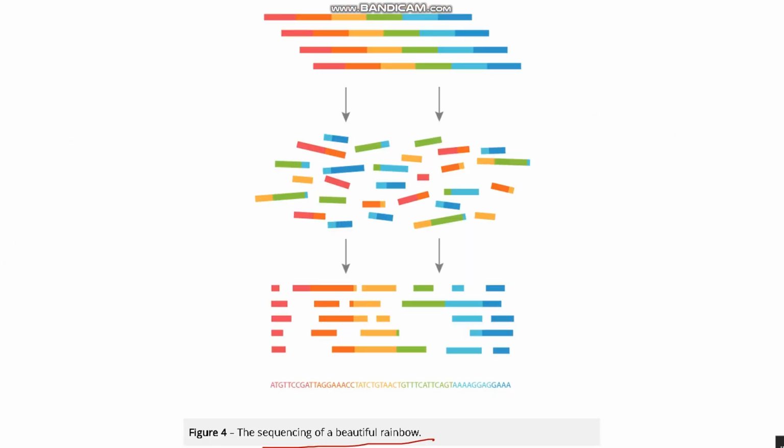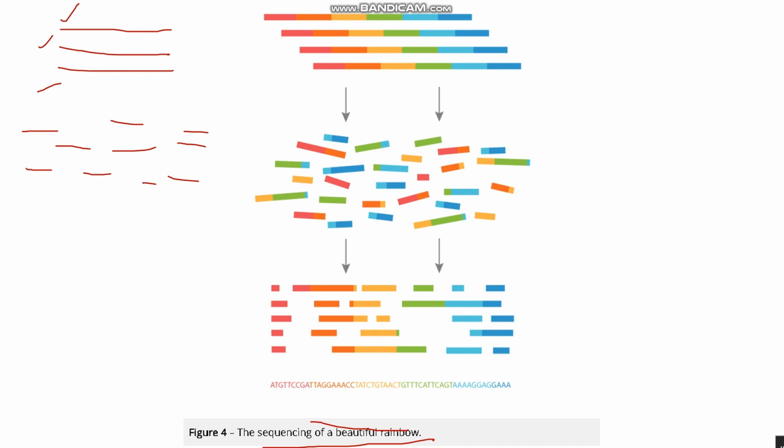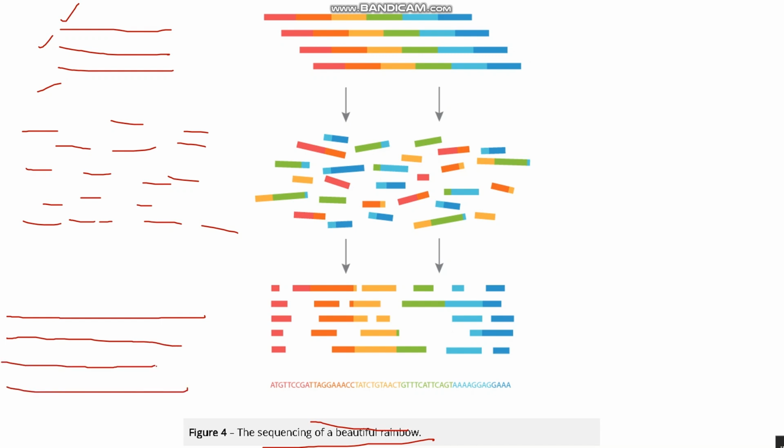Actually, it's a DNA fragment. Okay, we make the DNA fragments, and those DNA fragments are then aligned at the end.